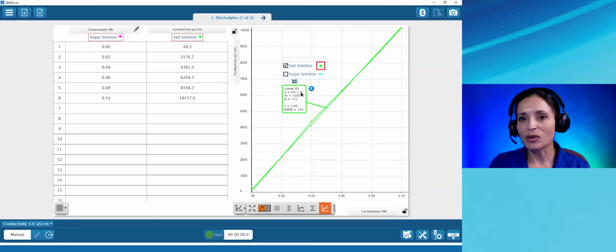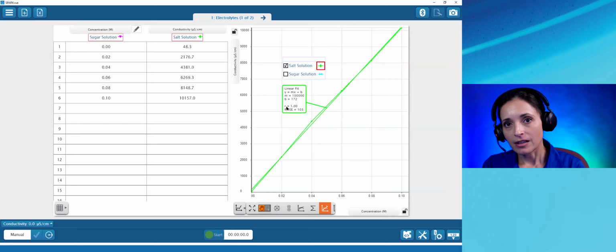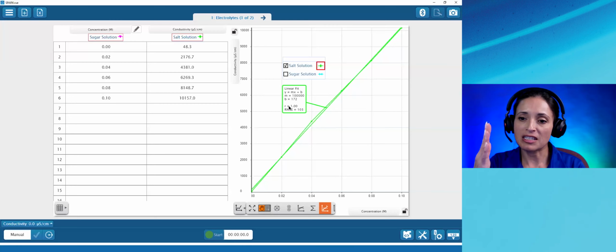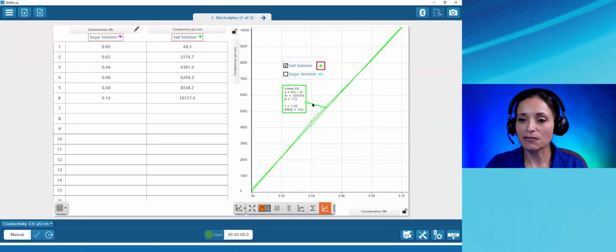But this time we can use the y-intercept b because concentration can be 0, and we do have a 0 value for that. Look at my fit on a linear fit. I can assess the fit with R. On a linear fit, you want an R as close to +1 or -1 as you can. It's -1 if it's decreasing. It's +1 if it's increasing. And we have an increasing. It's a perfect R equals 1. This is a very good fit for the data.